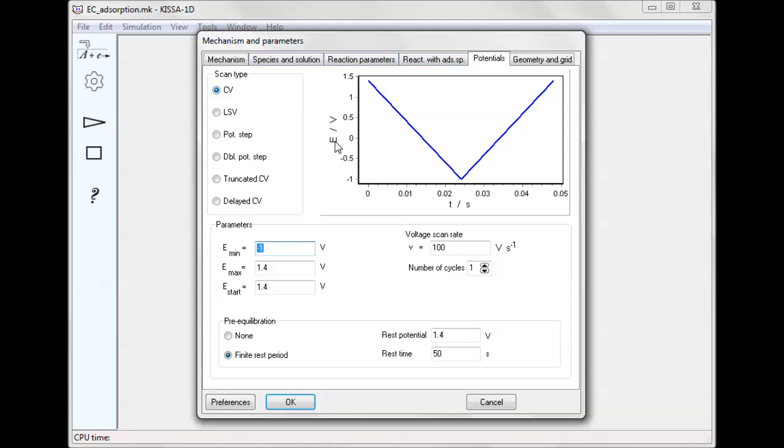On the potential tab, cyclic voltammetry is chosen for the electrode polarization, with a scan rate of 100 volts per second. As mentioned before, prior to the voltammetric scan, the electrode rests in the solution to allow pre-equilibration of concentration distributions of free and adsorbed species.